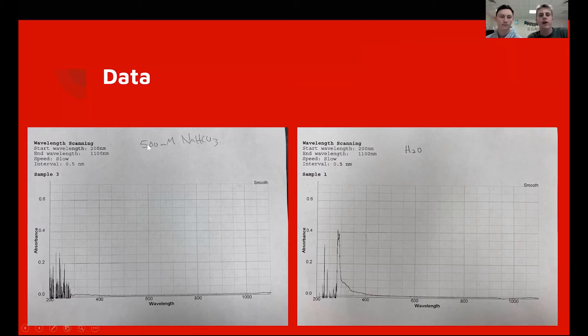So here's our 500 millimolar sodium bicarbonate. And this solution has a lot of activity between 200 and 300 nanometers, and its absorbance rate is pretty high. It goes up to about 0.3 absorbance. So hopefully that's what we've gotten our best results from is these sodium bicarbonate and the color as well.